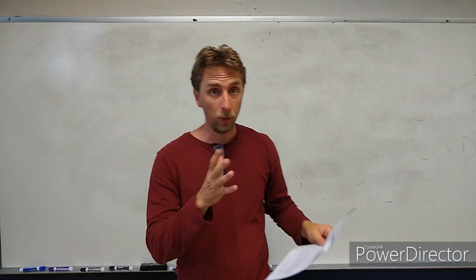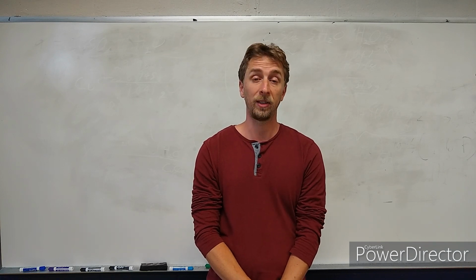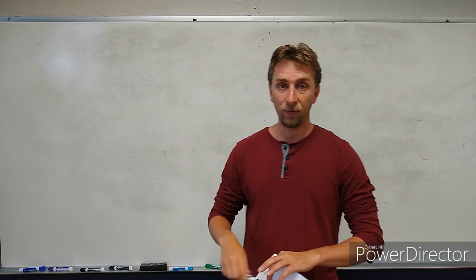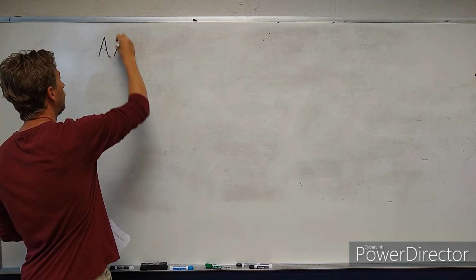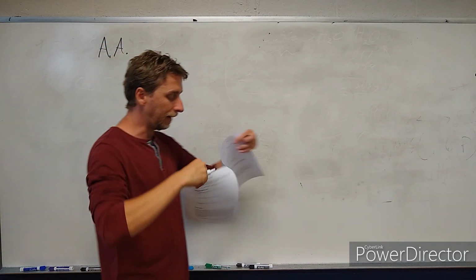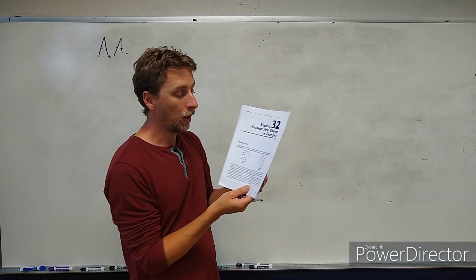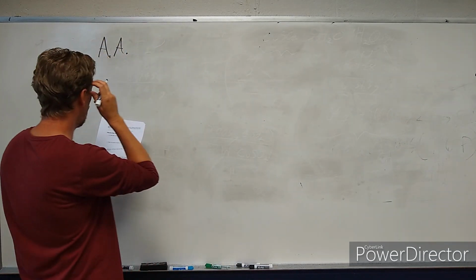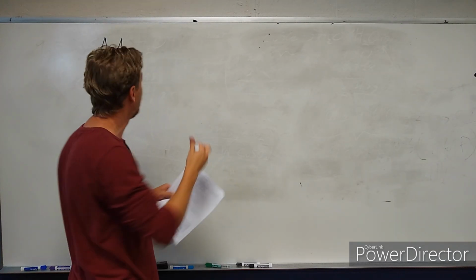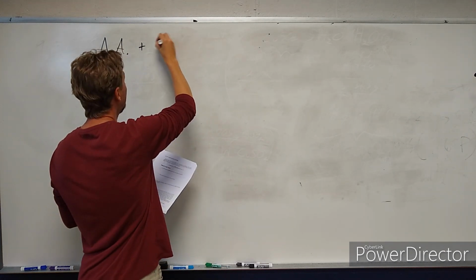Now I'm going to go over just a few things about the background theory. Vitamin C is most commonly thought of as ascorbic acid. For our reaction, a very simplified version of it, I'm just going to write it like this, where AA is ascorbic acid. Of course, in your lab procedure, they give you a molecular structure of ascorbic acid and compare it to glucose. We're not going to go into all of that much detail right now. But all that we really need to know for this lab is that 1 mole of ascorbic acid reacts with 1 mole of iodine.